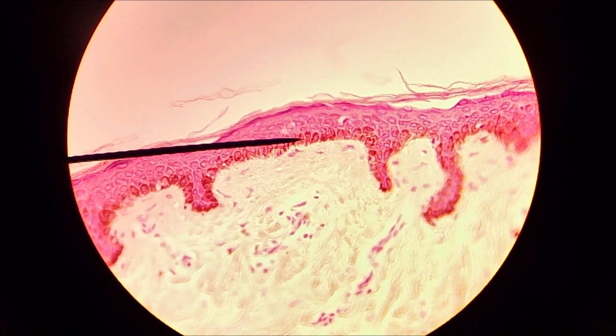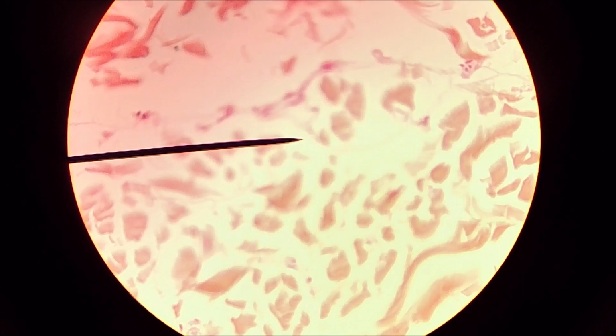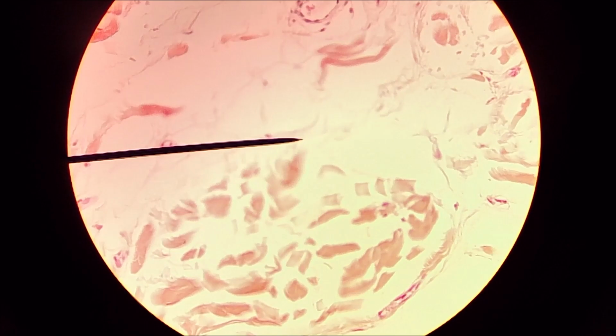And then, if I wanted to, I can pan down. Okay, there's another piece of, actually that might be a piece of an artery. There's some more glandular tissue. If I pan down and down, what I will eventually run into is all dermis of the skin. Dermis, still the dermis. We're panning down. It's hard to see, but I assure you, there are some little lines there. This is adipose tissue down at the bottom.